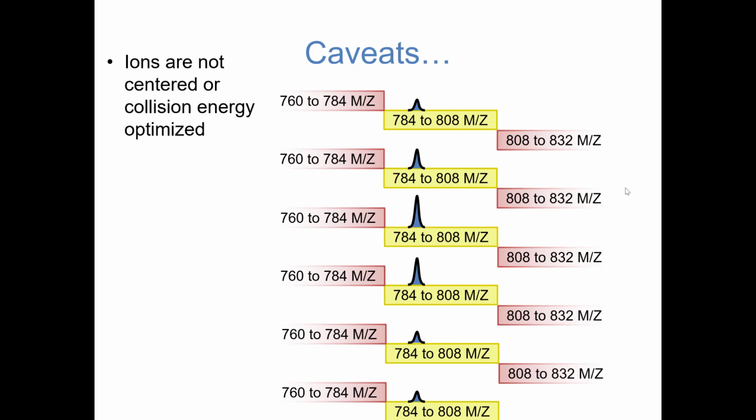What charge states are the peptides we're looking at? They're not all charge 2, right? Charge 2 to charge 5, charge 6, something like that. So you have to pick one collision energy for the entire range. Typically we would pick 2 or 3 because the vast majority of your peptides are charge 2. Maybe charge 3 is a reasonable enough compromise. But this charge state energy is definitely not optimized for that particular peptide, even from a DDA perspective, let alone from an SRM or PRM perspective.